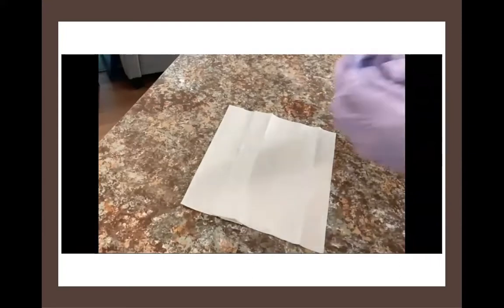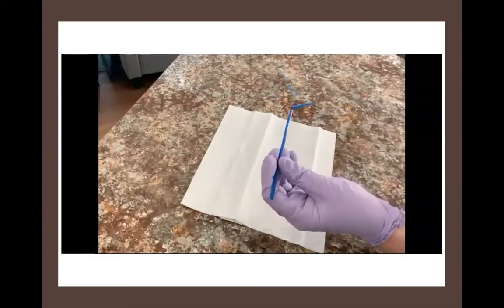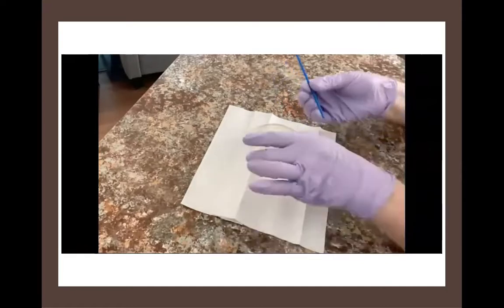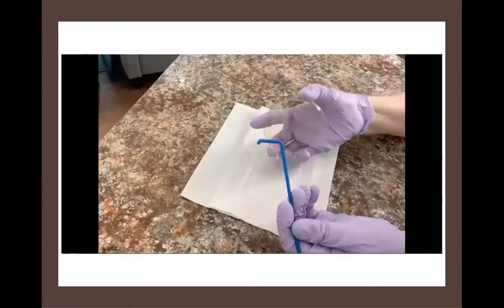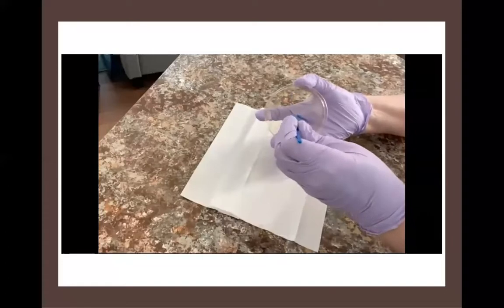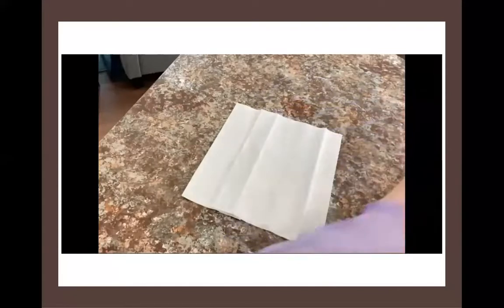Next on the list of tools is one of my favorites. This is called a hockey stick. Now you can buy a reusable glass hockey stick, but this is the disposable variety. Now watch what this stick is going to allow me to do. We've looked at how we streak cells across a petri dish, an agar dish. But sometimes we want to make a smooth coating of cells over the surface of that dish. And that's what the hockey stick does. See, you just swirl it around like the hands of a clock face, and you will spread your cells all over the surface of that plate, nice and evenly. One of my favorite tools in microbiology.